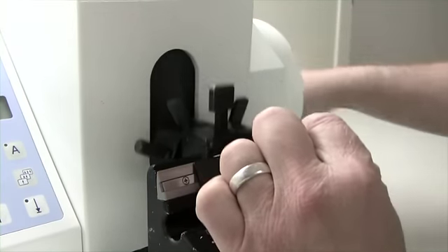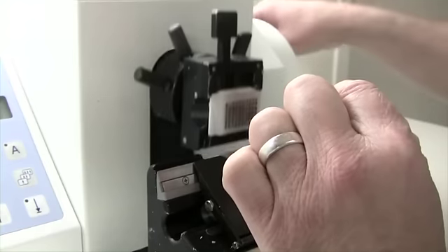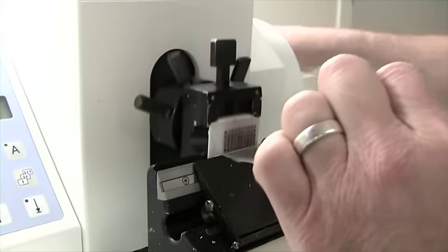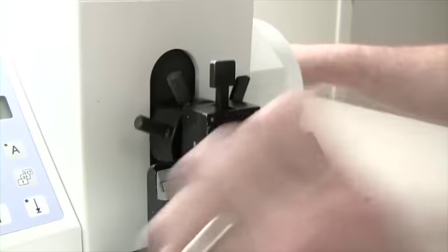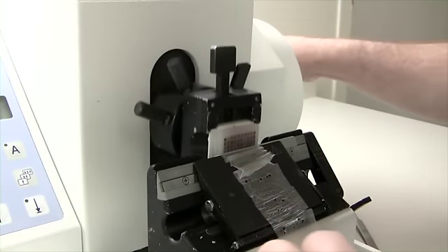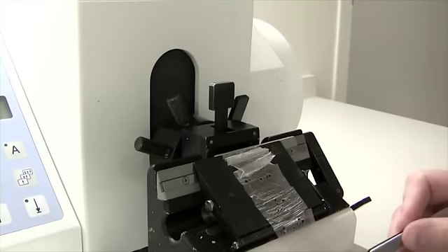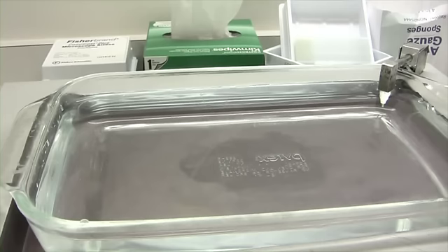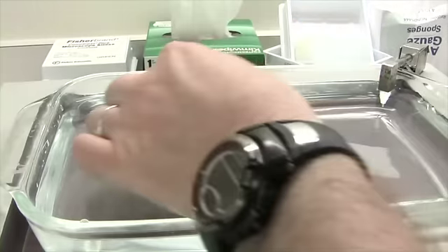Once you have trimmed into the block, put the block back on an ice tray and move the blade to a new area or change the blade. You can see in the tissue ribbon that some of the punch cores are missing. Actually, they have curled. This is common when cutting an array block. When you lay the ribbon on a water bath, they usually flatten out.